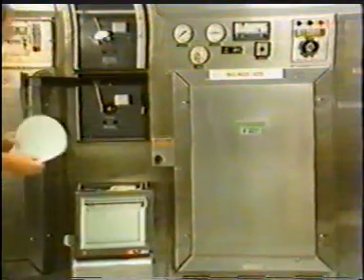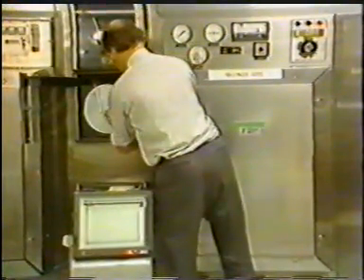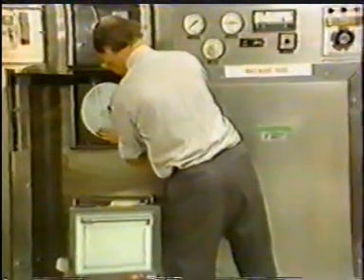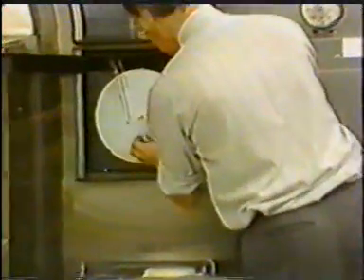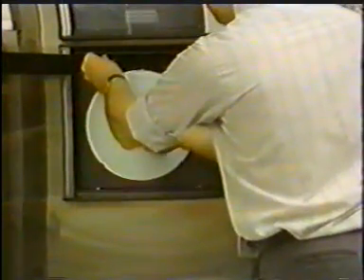In the case of heat sterilized products, the most important evidence is the temperature record chart produced by the autoclave. This will indicate whether the batch has gone through a satisfactory sterilizing cycle, although, once again, it will not prove that the contents of each container are sterile.